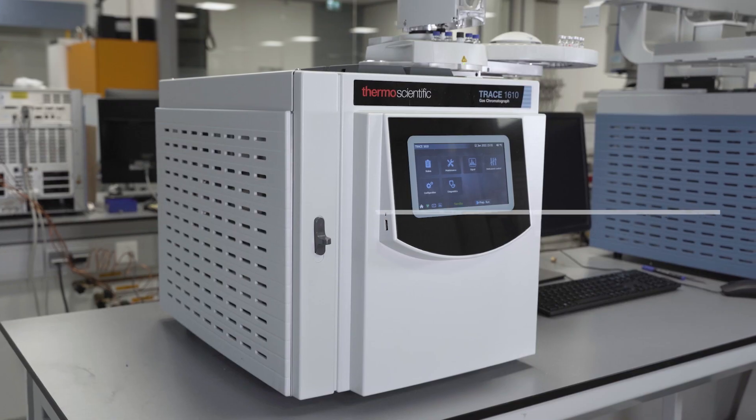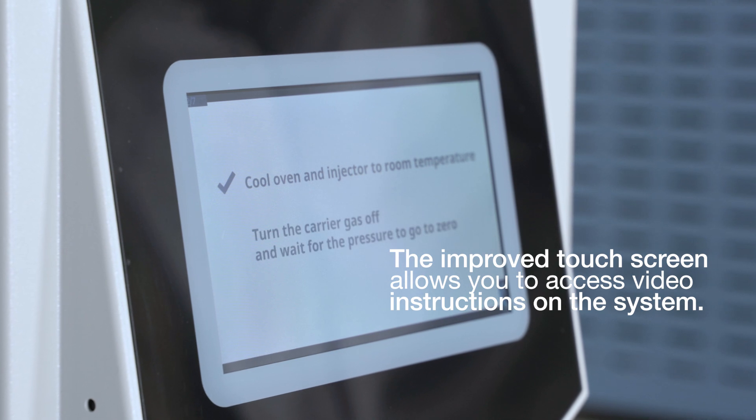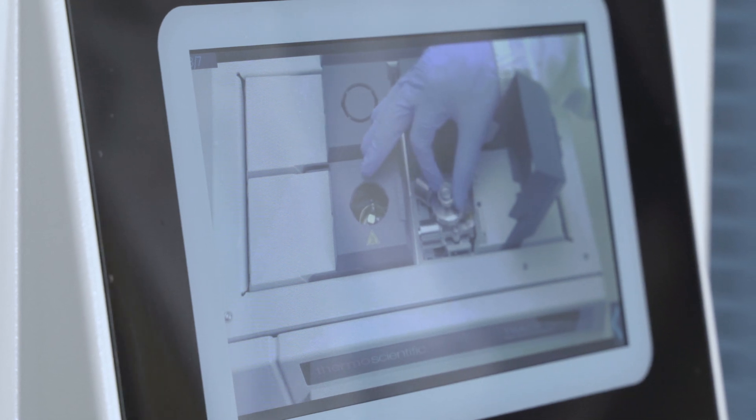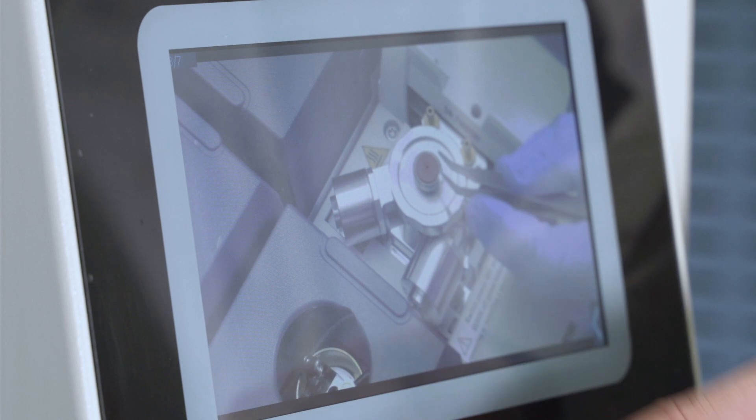Another thing I like about this new GC is the new and improved touchscreen they've put on it. One of the useful things you can do on that touchscreen is look at instruction videos on how to perform certain manual tasks on the GC, like switching a liner or your septum for instance. These are tasks that perhaps you will not do every day, but once per month when you have to, you may think how do you do it again — and it's very easy to look at an instruction video on the screen.